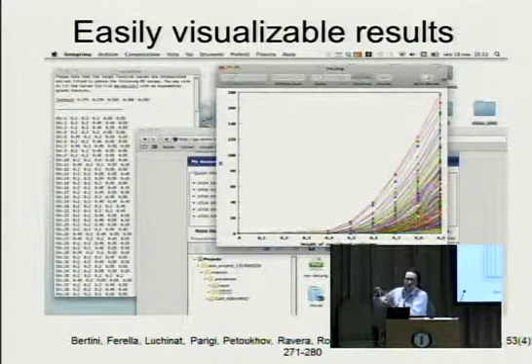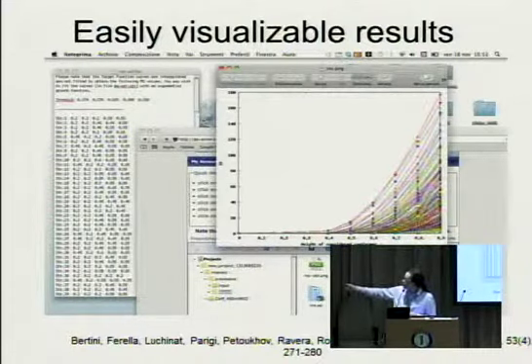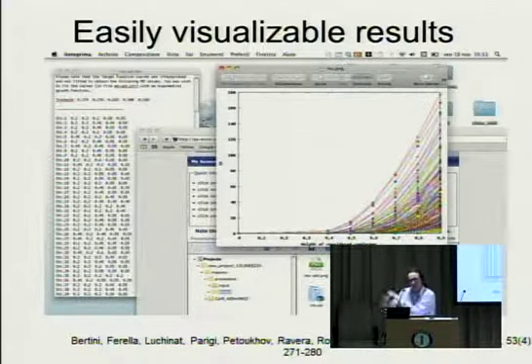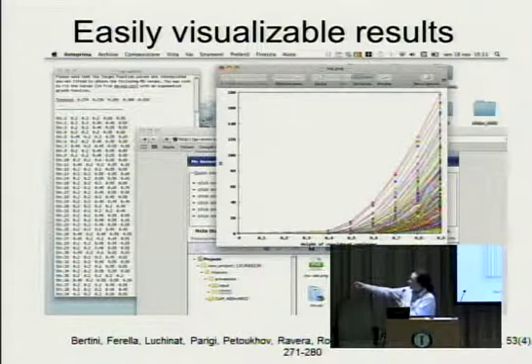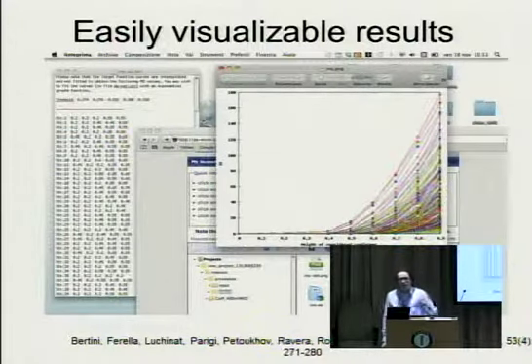So actually, after the first round of calculations, when you really know which is the limit value here, which can be 0, but sometimes it's not necessarily 0, because if you have some small systematic error, it will bring your target function to a fixed initial value that's different than 0. You can actually tell the program, look, please don't compute low weight ensembles, and just set the limit that it should go to 5 or 20, whatever.